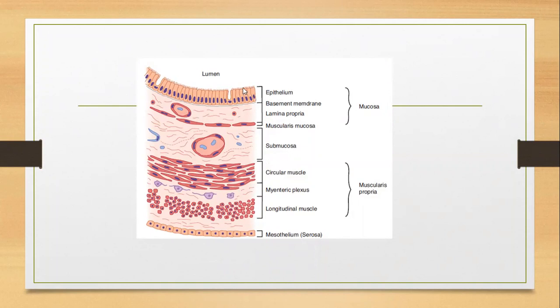Towards the lumen, they have some cytoplasmic extensions, which we call the microvilli. Now, within some of these epithelial cells, you can see that they have this indentation, open area. These cells are different from the columnar cells. These are usually the ones which will secrete mucus and it will come into the lumen.